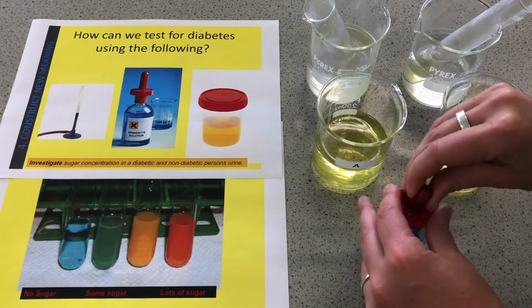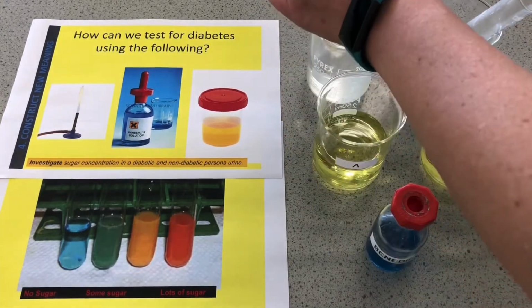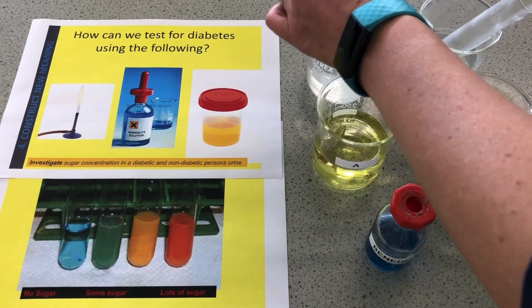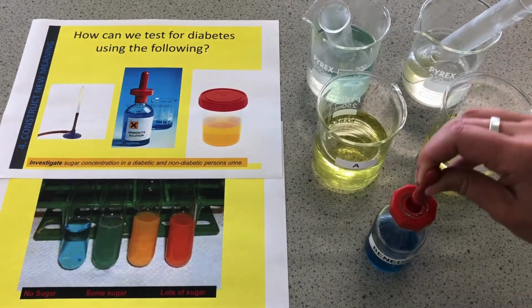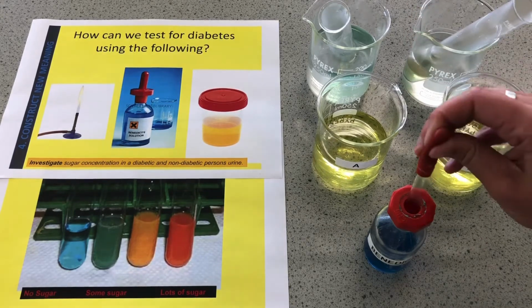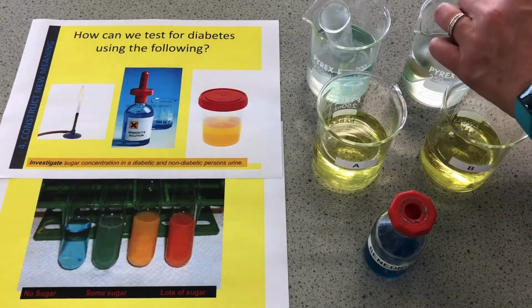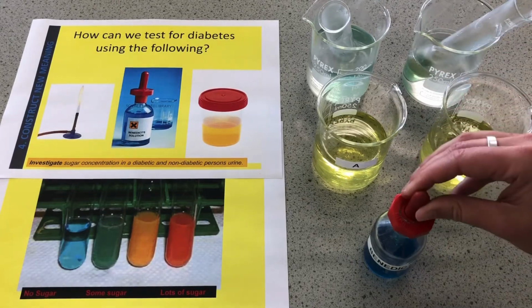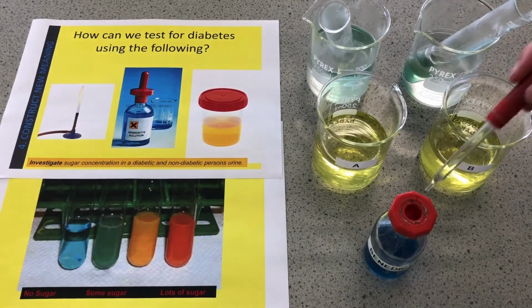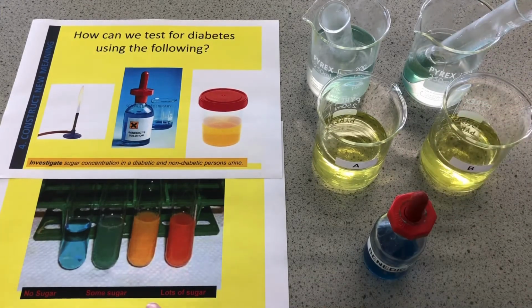So we're going to add plenty of the Benedict solution. And you can see again on the picture there, we've got that colour change. It's the traffic light system, where if there's a small amount of sugar, we'll get a colour change to green. Bit more, we get a colour change to amber. And if there's lots of sugar, alarm bells ring, we get the red colour. It's kind of that traffic light system of colours, which helps us to remember some sugar going through to lots of sugar. Now this is heat activated and it takes about 20 minutes to work, so I'm going to leave that for the moment and come back to you in 20 minutes.